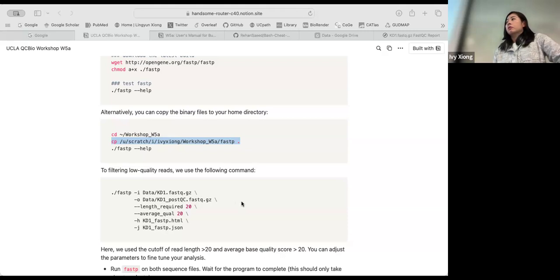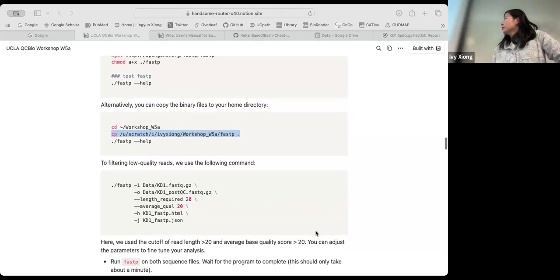If I were to enter these one by one, I had to do the first line, then again dot slash Fastp minus O, the same thing. I had to run it in multiple lines. So for this, just copy and then paste in one go, and enter. That's what we did.